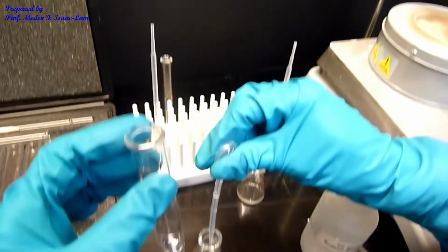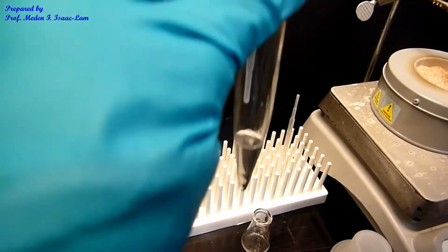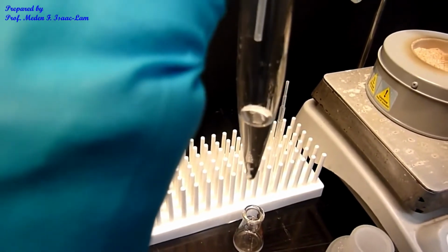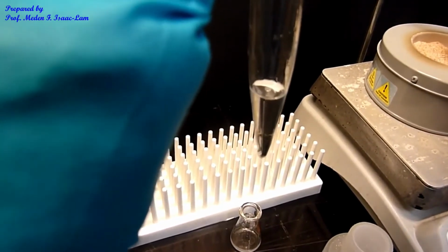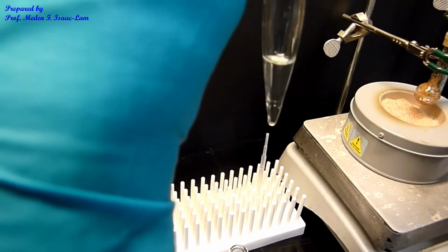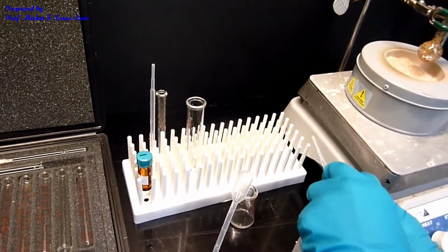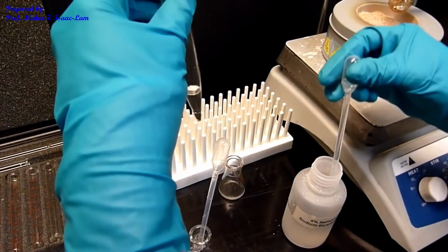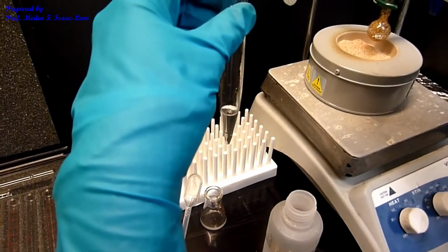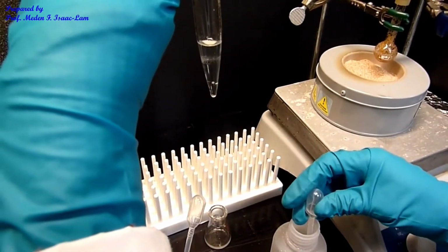Okay. In case I'm not sure, I can actually not put it in the sink yet. I took out the bottom by using the pipette. Okay, so there's still a layer in here. Because it's still fizzing, I'm going to add more sodium bicarb and wash it one more time. You can see that I know that it's the lower layer because it's going to go down. So the wash is the lower layer.